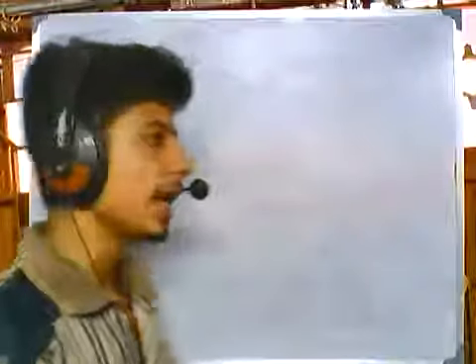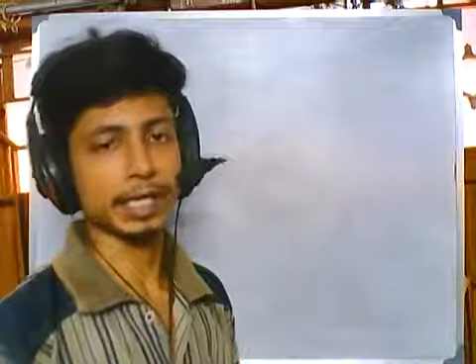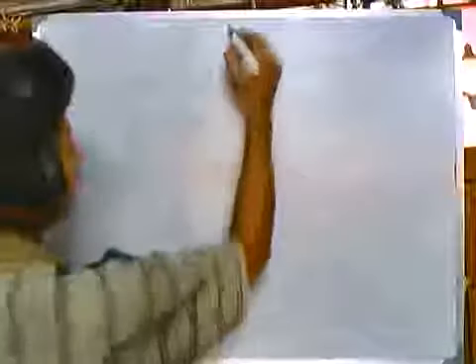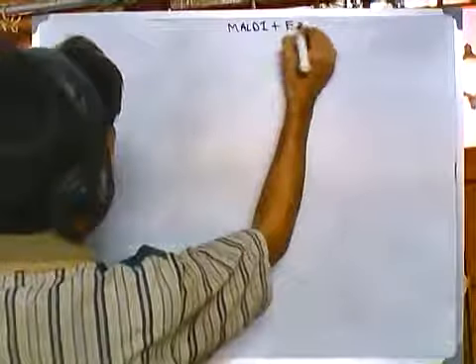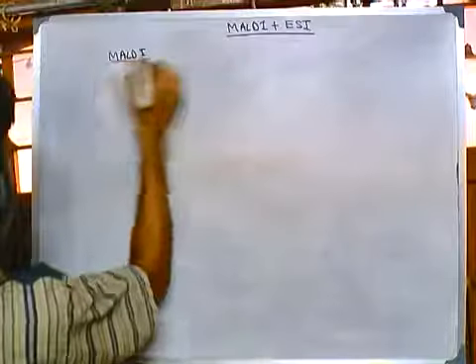Now, one thing we haven't discussed yet is the different types of mass spec available nowadays. In this video we'll be talking about two such types of mass spec instruments and analyzers: one is called MALDI and another is called ESI. Though they are different, they are utilized in different mechanisms for different reasons. We'll be seeing all of them. Now let us first talk about MALDI.